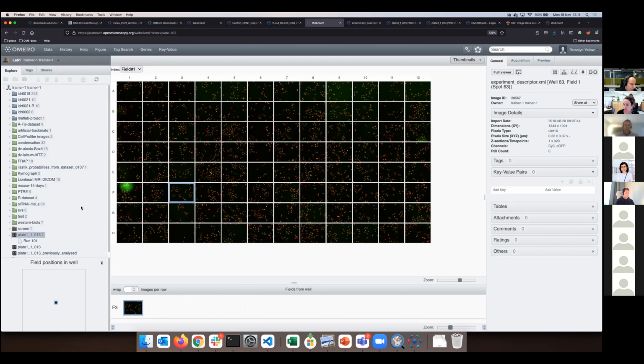I think we should go over the annotations and then over Omero Parade. But most importantly, are there any lingering questions, or did I go deep enough into everything which was of interest?